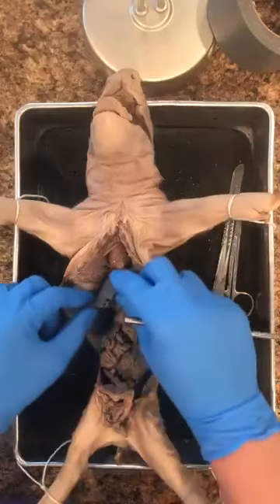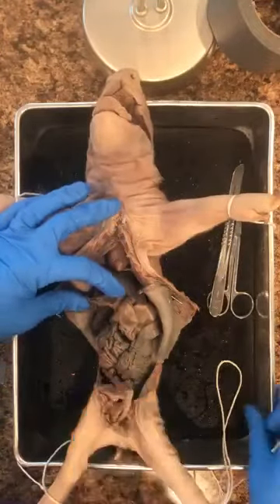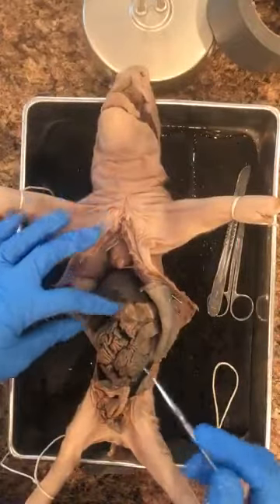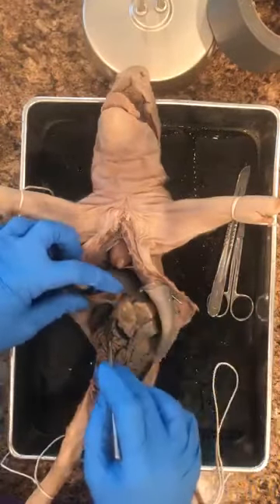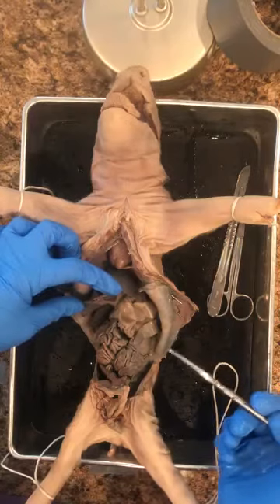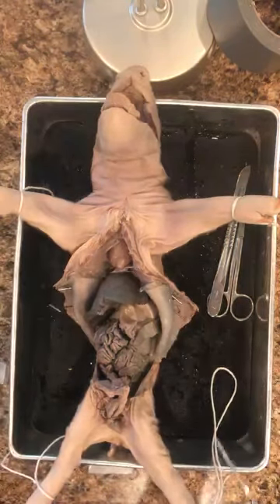Okay, we talked about the gallbladder. So the gallbladder is right here. Still a sac, but it's not really green, like I said. The gallbladder has ducts that attach to the liver, so they're little tube-like things, and they're going to carry bile from the liver into the gallbladder and back again, and the bile is going to aid in the digestion of fats.